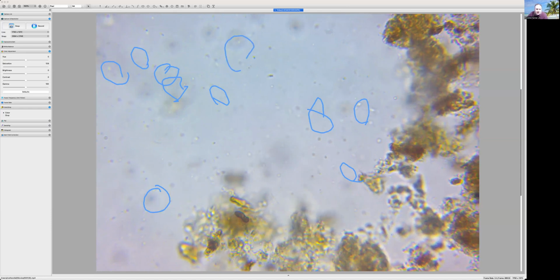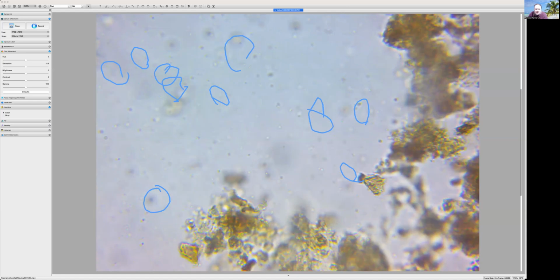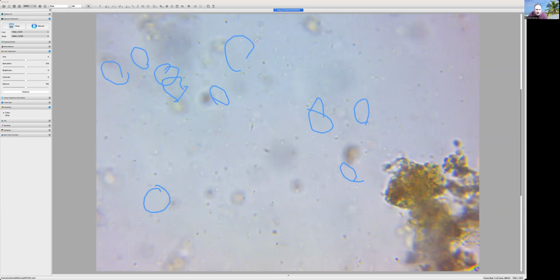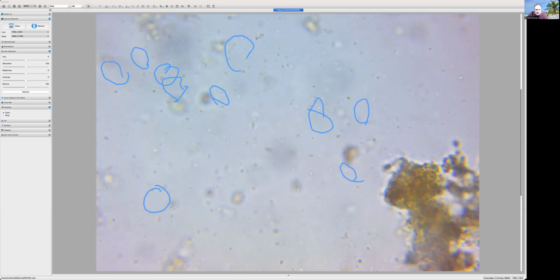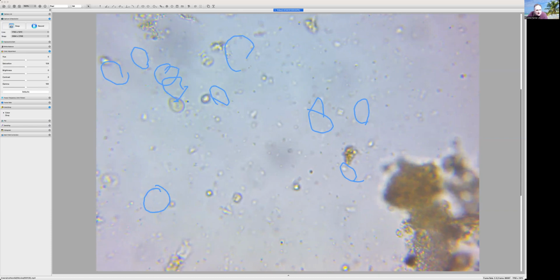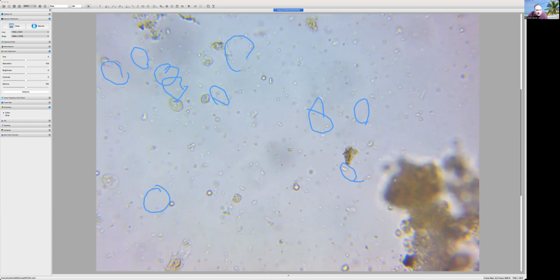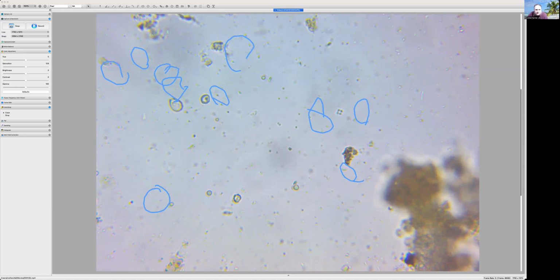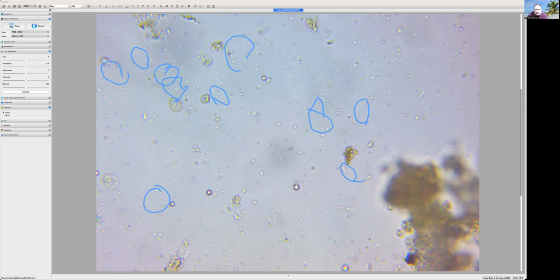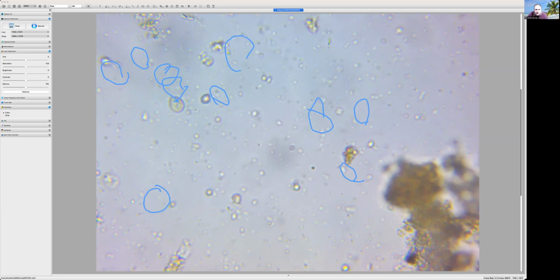Just wanted to kind of see. I need lots and lots and lots of practice so I can identify them quickly with just slight... Okay, somebody's spinning up there. Oh, they're just banging around in and out here and there.